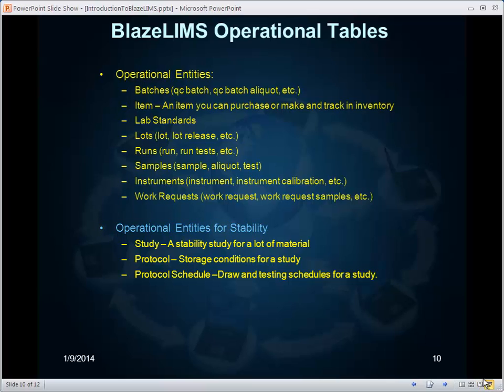In systems that do use stability, there are studies. A stability study defines the storage and processing for a lot of material. A study might have protocols, storage conditions for that study, and each protocol might have a schedule for drawing and testing associated with the study.